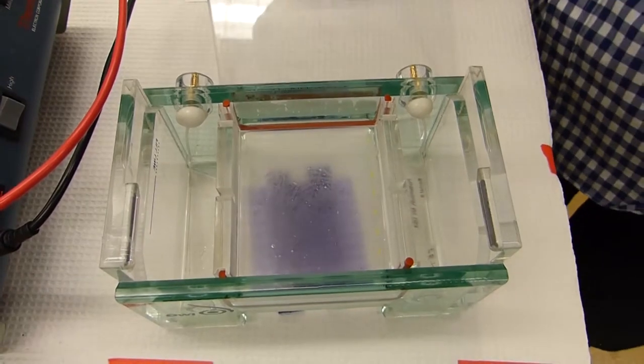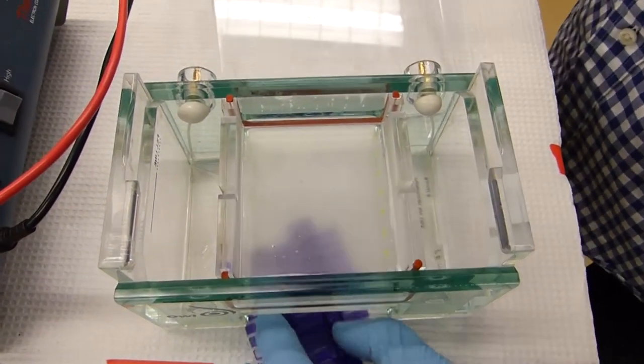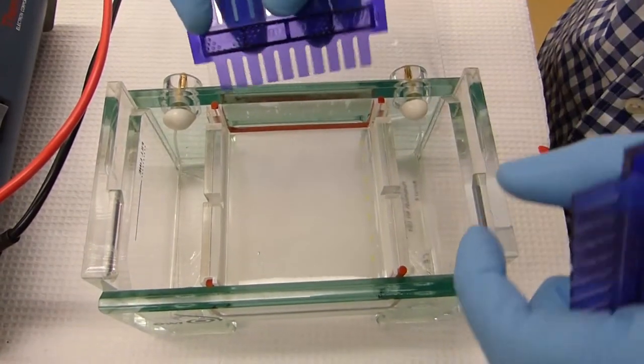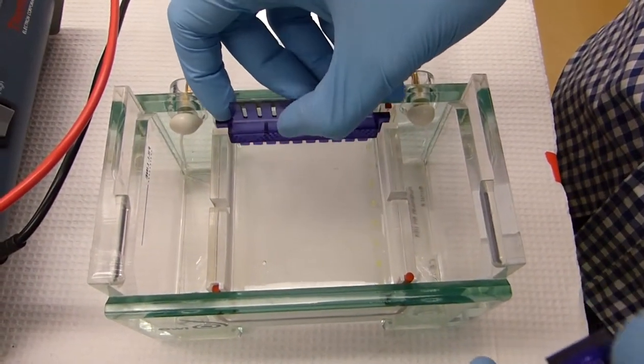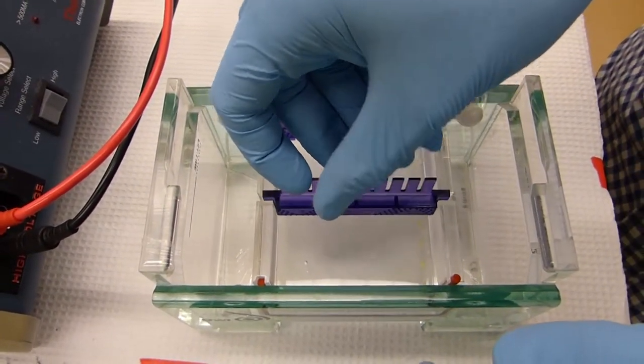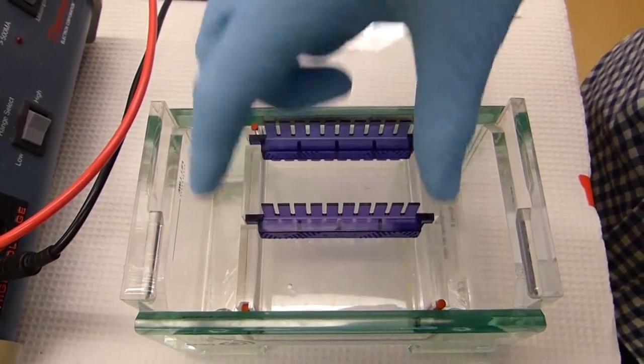Once you've added about 50 milliliters, you can add the two gel combs to add the slots for your gel. Depending on what you're doing, you may be using one or two gel combs. In this case we are doing two gel combs or a double decker.